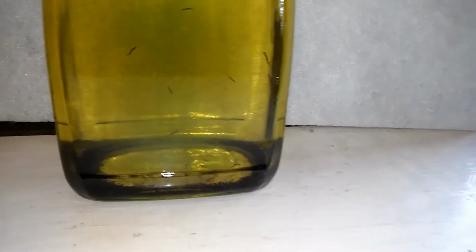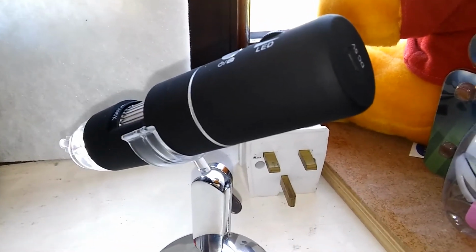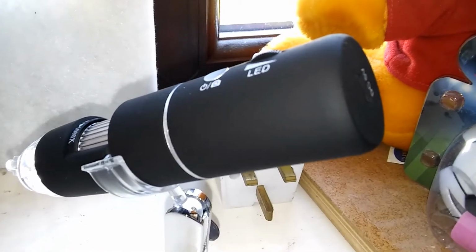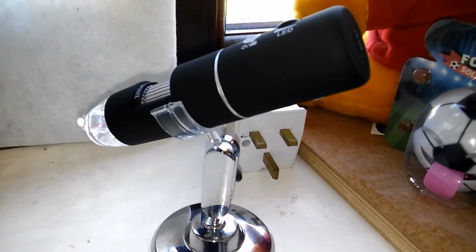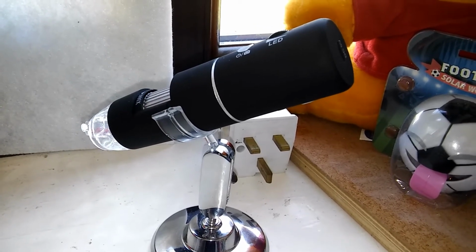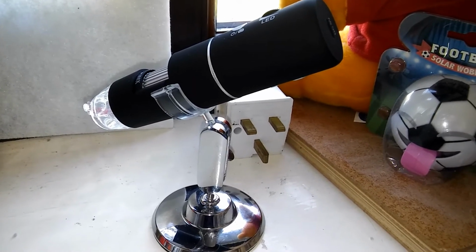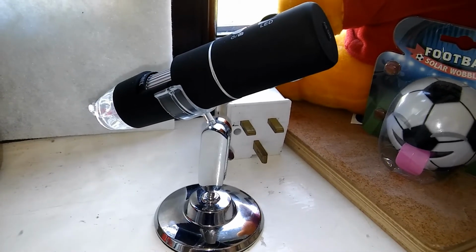But what we're going to try today is my new wireless microscope. I'm having a few problems with it. It drops the Wi-Fi signal to my phone, and when it does work, it fills up the memory in my phone. It won't record directly to the SD card, it records to the internal memory, and I'm very short of internal memory on this phone, but we'll give it a try.